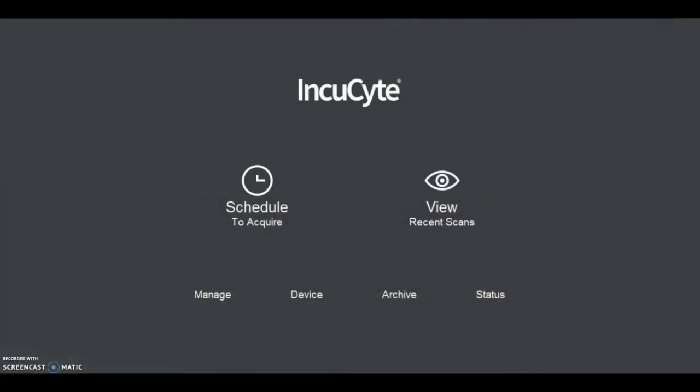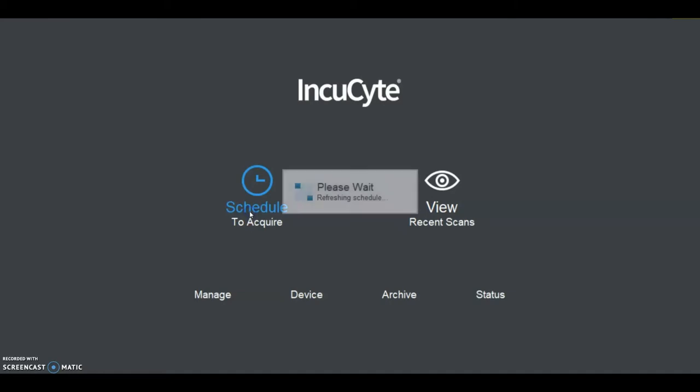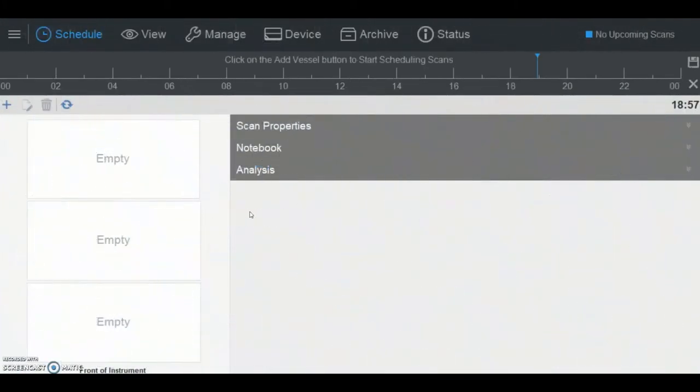To start scanning a vessel on the Incusite, click Schedule to acquire. This will open up the acquisition window where the current vessels scheduled to be scanned are displayed, along with the timeline showing when these scans will occur.